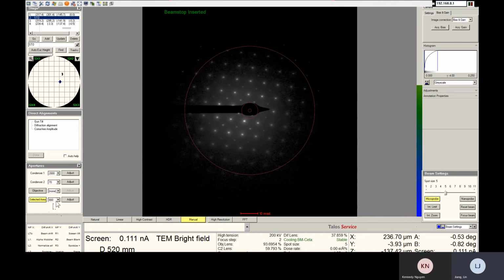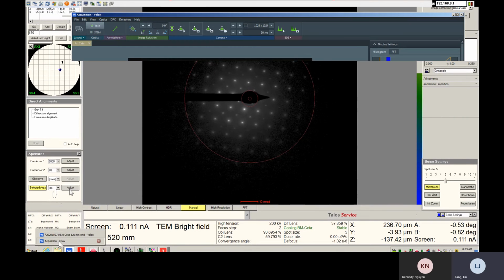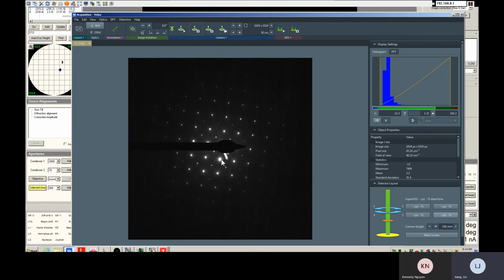And then you get the right select aperture, and then you go acquisition, and you can preview how much count you get per minimum acquisition time, minimum exposure time. Once you did that, you get the idea how much intensity you get in this map. Actually, for this one, you get almost 8,000 here.